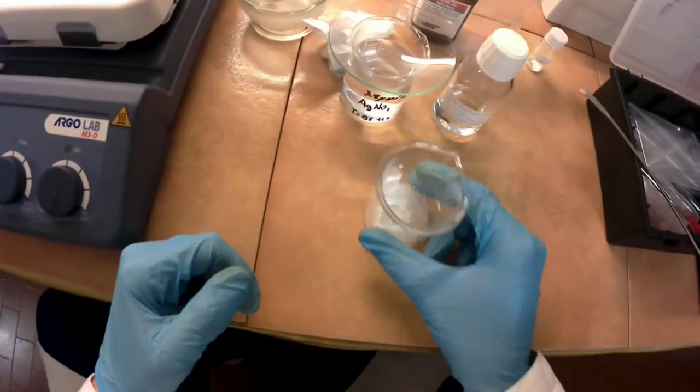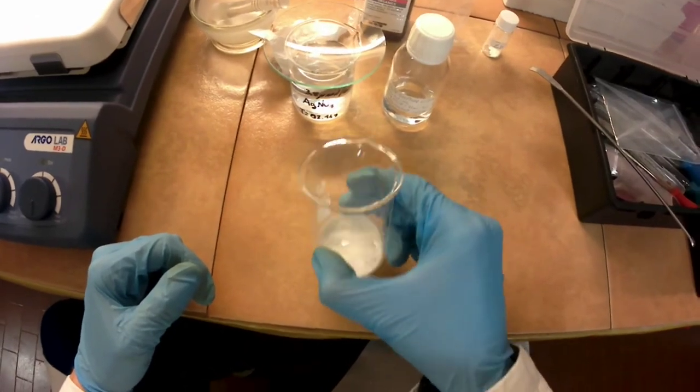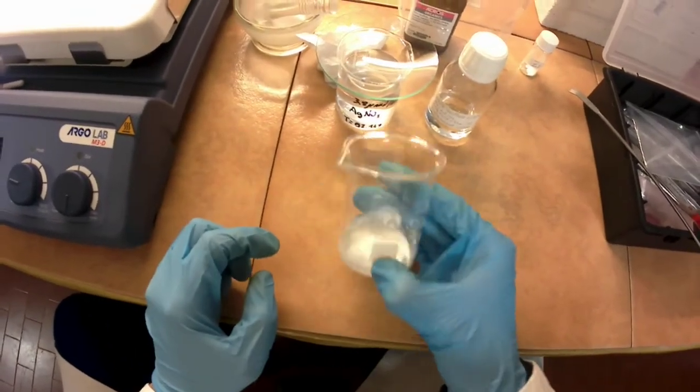First, weighing out the required tiny amount of silver nitrate is almost impossible, while it is possible to make a solution of heavy concentration through dilution.